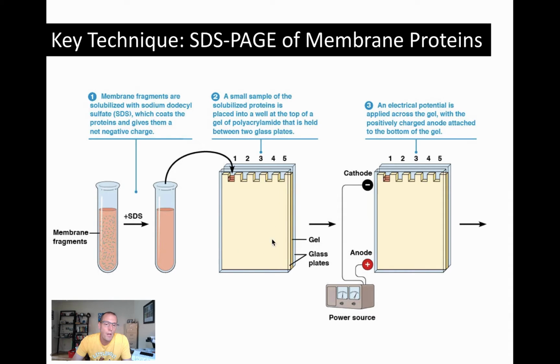And so the polyacrylamide gel is sandwiched between these plates, and you have these little cutout wells in the top where you can load anywhere from 15 microliters up to maybe 30 or 40 microliters. So that's your sample that's been boiled up in the SDS and beta-mercaptoethanol.